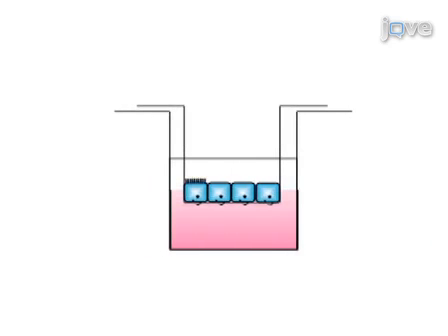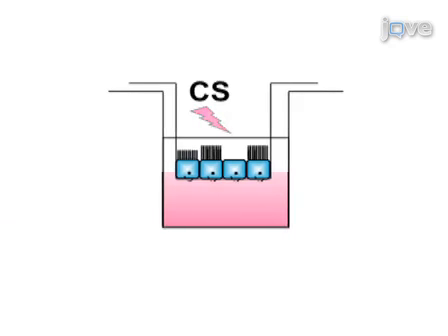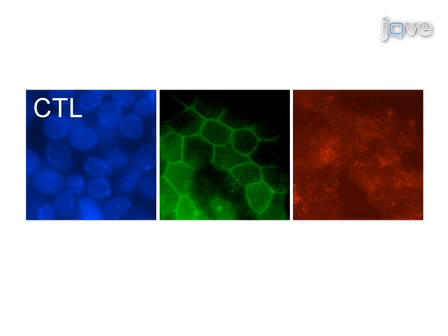The third step is to differentiate the cultures at an air-liquid interface. The final step of the procedure is to expose epithelial cells to apical cigarette smoke at the air-liquid interface. Ultimately, results can be obtained that show a fully differentiated monolayer of epithelial cells by immunofluorescence microscopy.